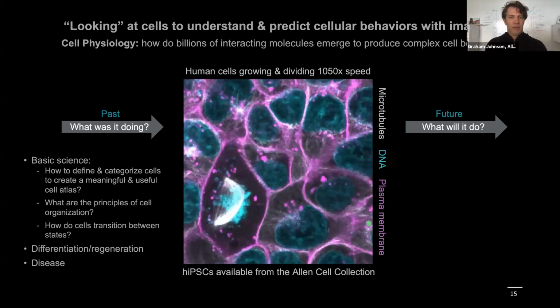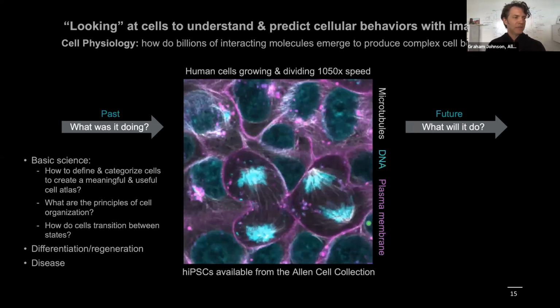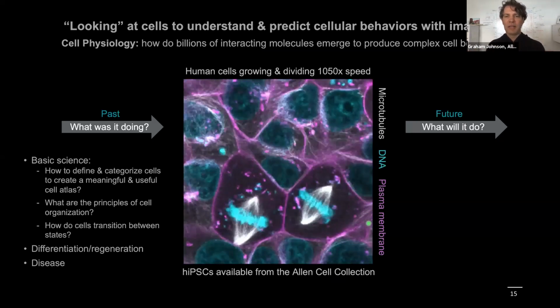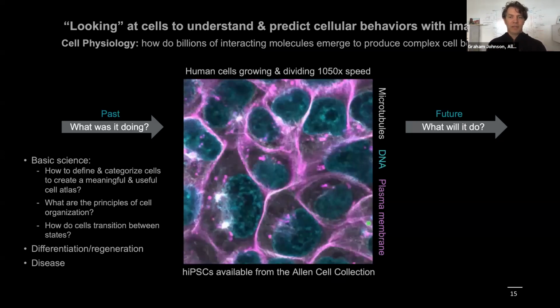And what if I gave you the time lapse, or if I let you watch 20 other time series movies of the same cell line under the same conditions, where we're watching microtubules pull the DNA apart within the bounds of the plasma membrane in pink? Would you be able to then predict when each cell is likely to divide?